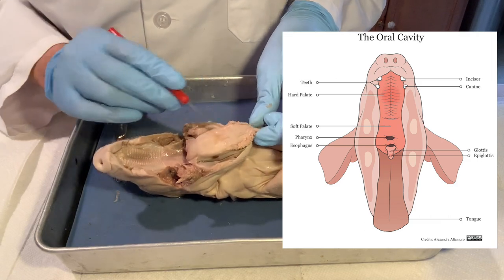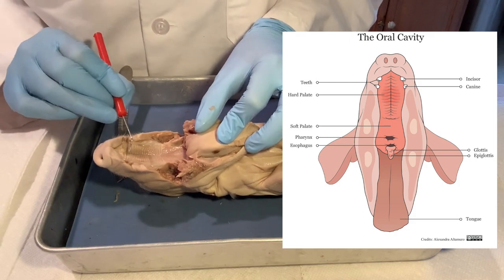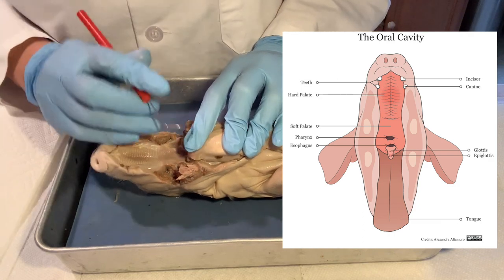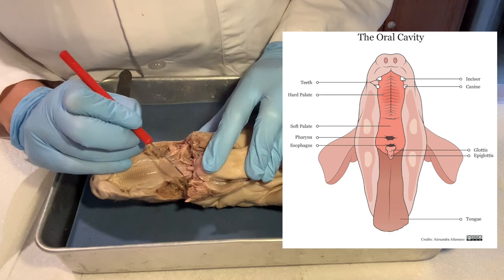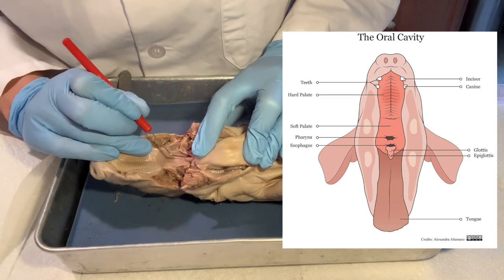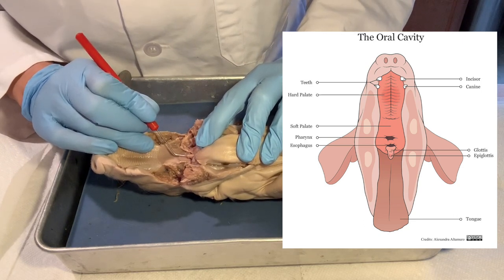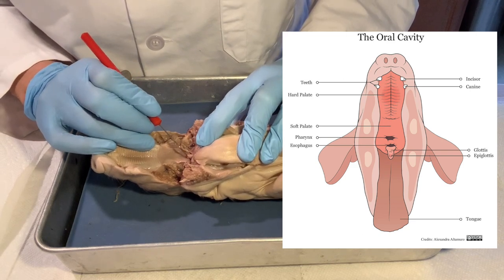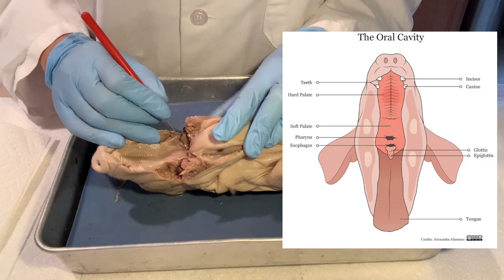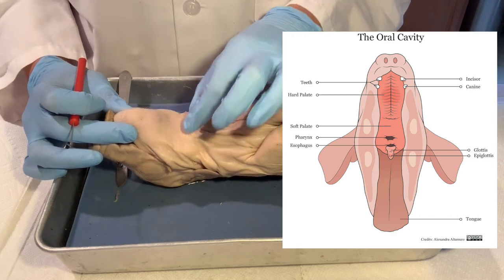Now we have the big joker smile — the poor little pig has been completely disfigured. Here we have the typical ridges — this is the hard palate, the roof of the mouth. Then there's a part with no more cartilage and no more ridges — this is the soft palate. Be careful with the spelling: palate is P-A-L-A-T-E. Here we have the tongue, the teeth. The structures I was really getting to are this little flap — the epiglottis — and there's an opening in it called the glottis, where I'm putting my probe. This leads to the trachea, your windpipe, right here.